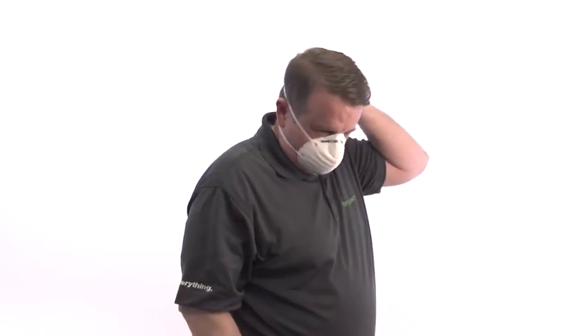To remove the mask, gently pull on the elastic straps and pull the mask away from your face, being careful not to touch your face during the process.